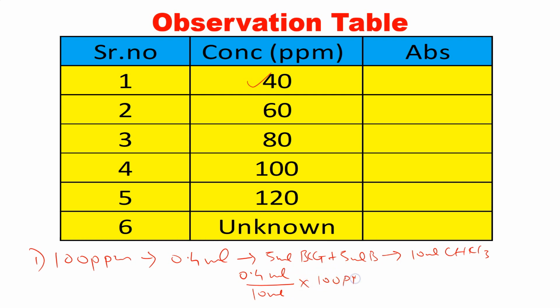From the 100 ppm we pipetted out this solution, so now the concentration becomes 40 ppm.